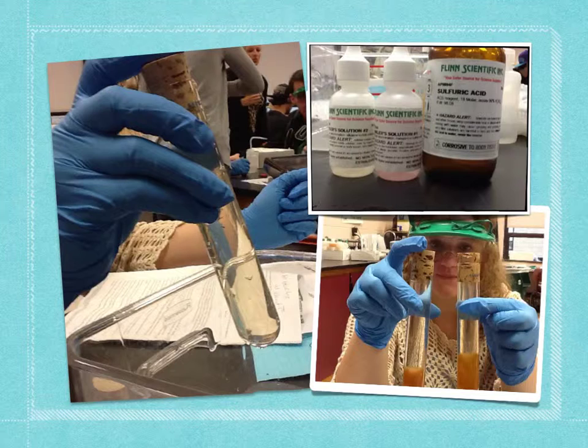Step 3. We added 6 drops of Winkler solution number 1 to the samples, as well as Winkler solution number 2. We put a stopper on the test tubes and inverted them to mix their contents. When this happened, a brown precipitate formed. The precipitate eventually settled to the bottom.